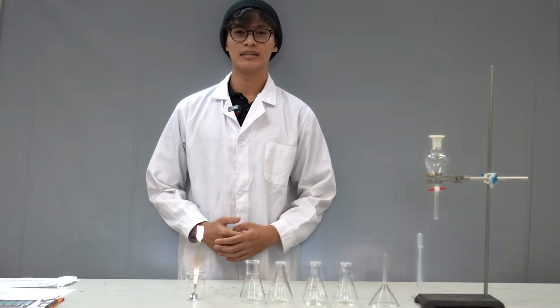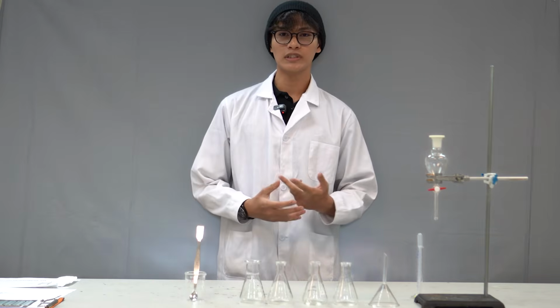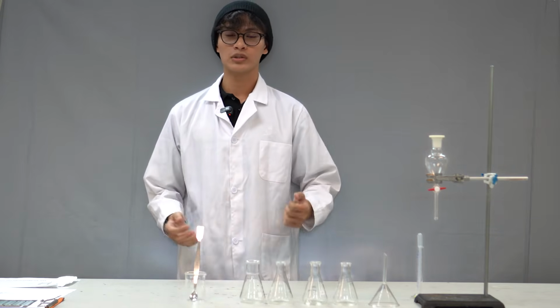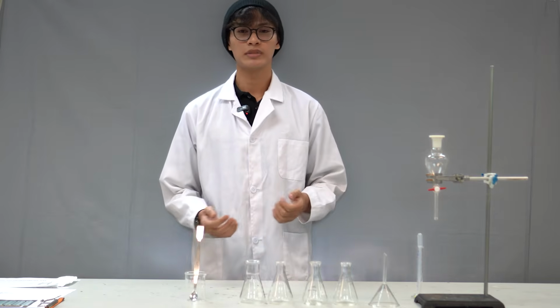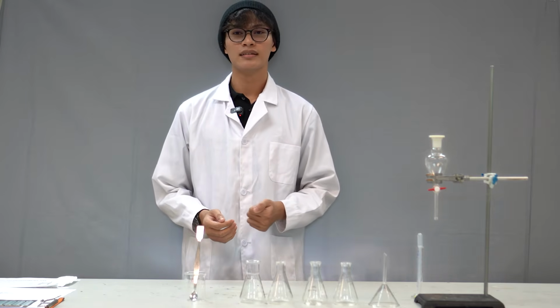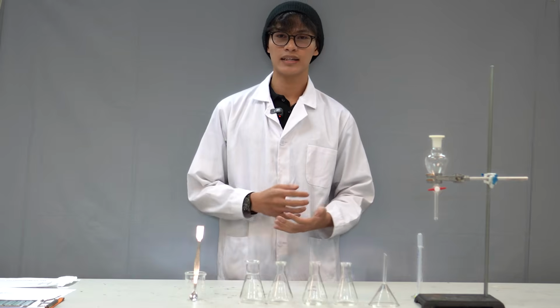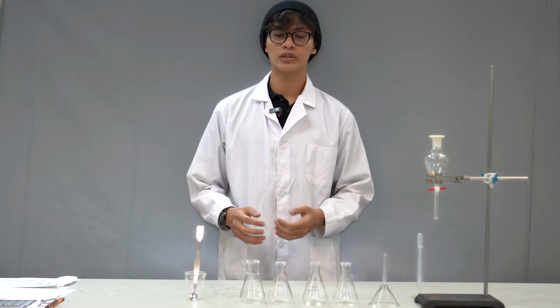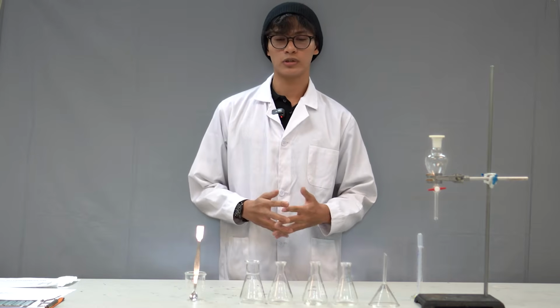Okay, so firstly, I'm Hazami and I'll be responsible for the parts on the introduction, problem statement and precautions that we took during the experiment. So first, we'll go to the introduction. Sometimes, upon the extraction of a natural tissue, a complex mixture is formed, in which case additional separation methods must be used, and these extra steps are performed in order to remove impurities to obtain the pure substance that we require.